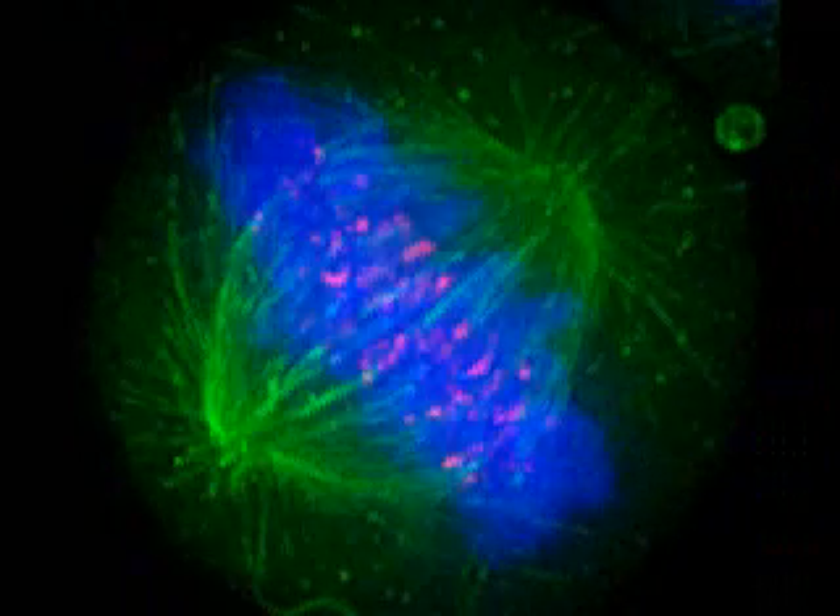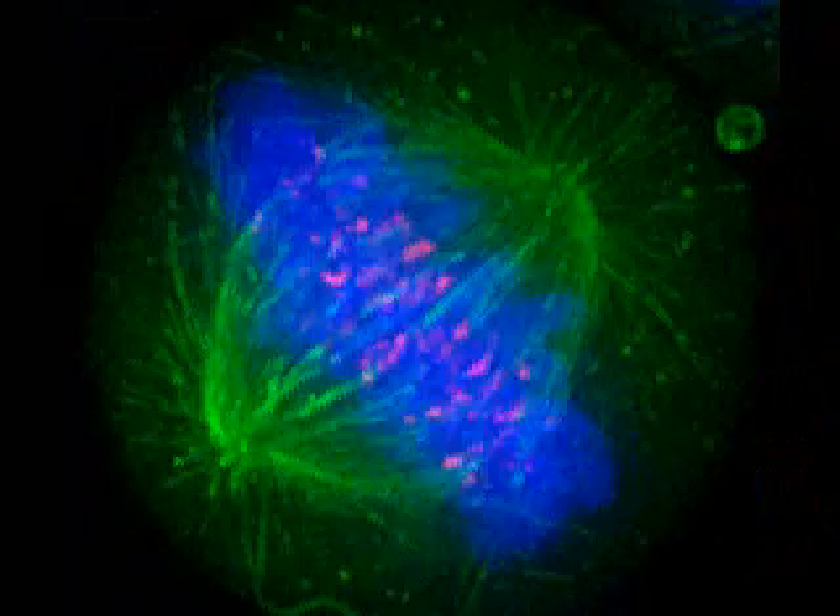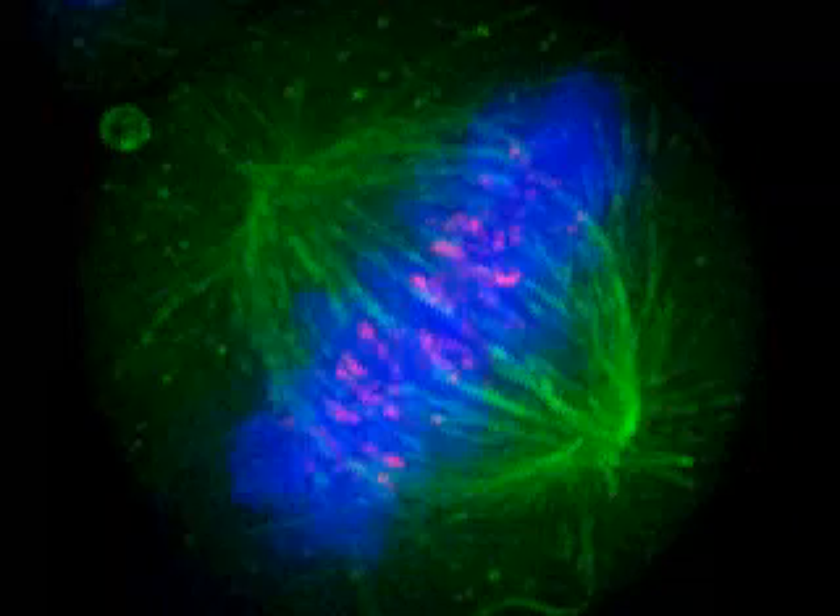The mitotic spindle of a dividing human cell is reconstructed here in its full beauty from multiple optical sections that were recorded with a fluorescent microscope. Microtubules are stained in green, DNA is stained in blue, and the kinetochores, where microtubules attach to the DNA, are stained in pink.